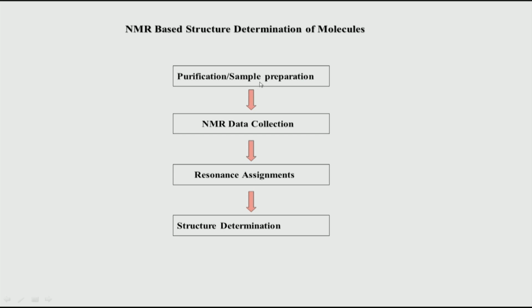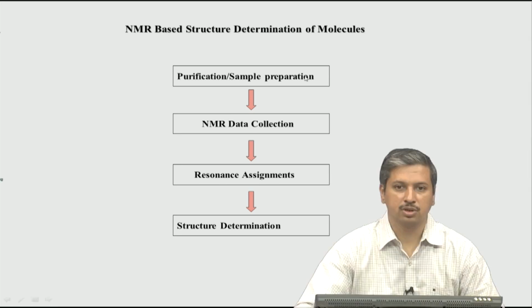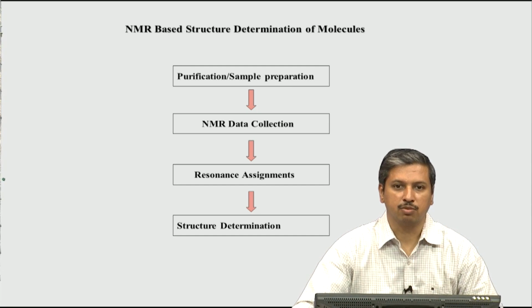The reason for this is that the impurities present in your sample will give extra peaks or correlations in your 1D and 2D NMR, and that can lead to ambiguity or doubts in solving the structure. So, if it is more than 95% pure, it is very unlikely that the small impurities will give any strong correlations in the spectrum.